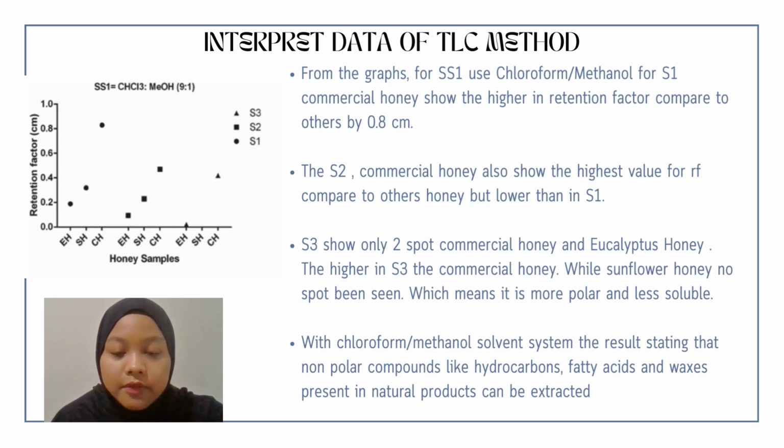So the result for the chloroform methanol solvent system, or what we call the mobile phase for TLC, had reasonable similarity with some earlier reports, stating that non-polar compounds like hydrocarbons, fatty acids, and wax present in natural products could be extracted. So I will extract the data of TLC.